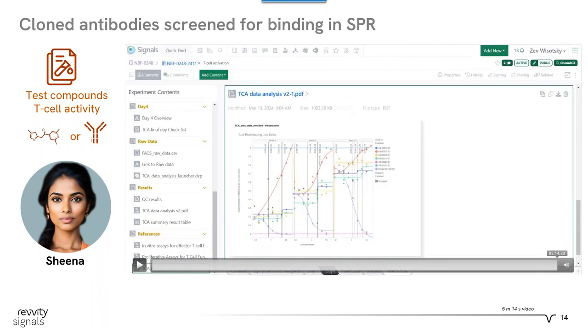Lovely. Well, what we were looking at there was the IC50 and Hill slope curve analysis for each donor and drug candidate. And this is very useful when looking at drug safety and efficacy.